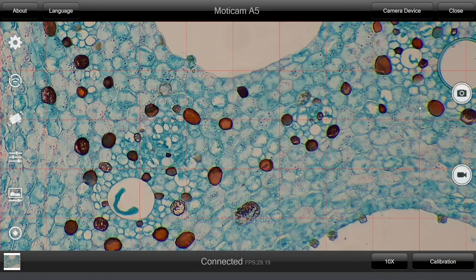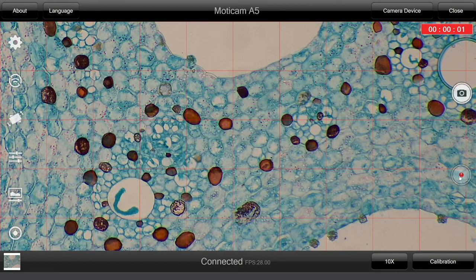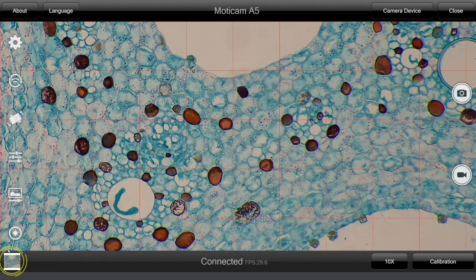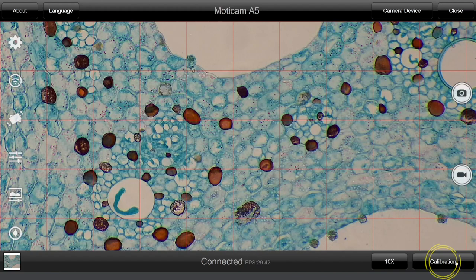On the right side you will find the capture button and the video record button. Your findings will be stored in the gallery which you can access from the bottom menu, where you can also find the calibration options, to which we will dedicate a separate video.